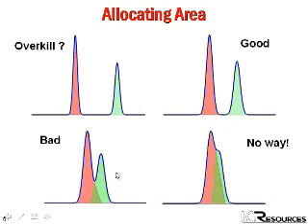When we get to the case in the lower left corner, though, in terms of quantitation, we're beginning to run into some problems. We can see that there's overlap in between the two peaks, and if you have peak tailing or something else, you can have special problems. If the peaks are similar size, you may be able to drop a perpendicular between the peaks and allocate the area accurately there, or peak height can be used. In this case, the center of the peak, where the peak height is measured, doesn't overlap at all. But in general, this is a much less satisfactory arrangement than the one in the upper right.